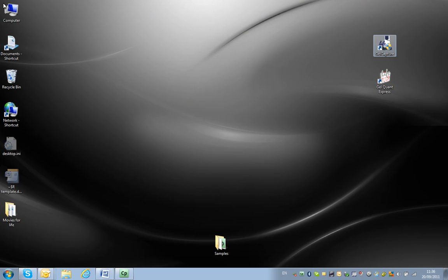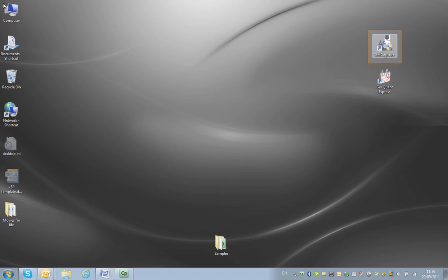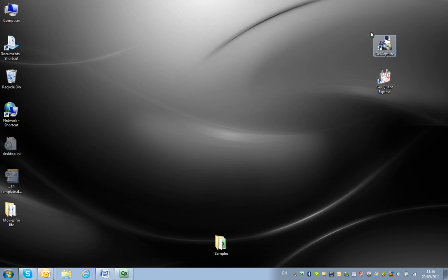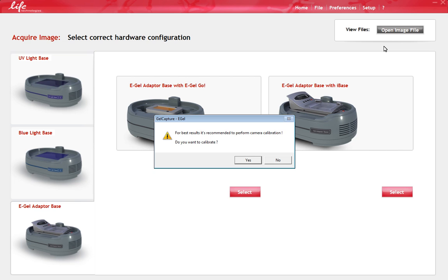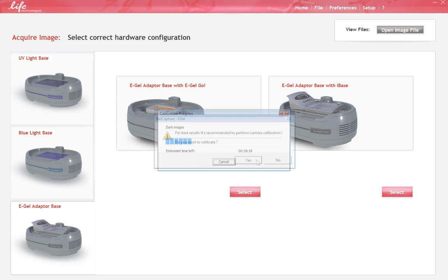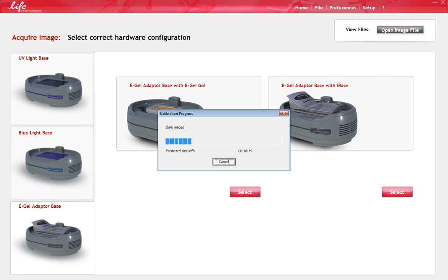Open the Gel Capture software by double-clicking the icon on your desktop. The first time you use the Gel Capture software, you will be prompted to calibrate the camera. Please follow the instructions given by the software to calibrate the camera. This is a one-time procedure that takes about 25 minutes to complete and will optimize the camera's performance.